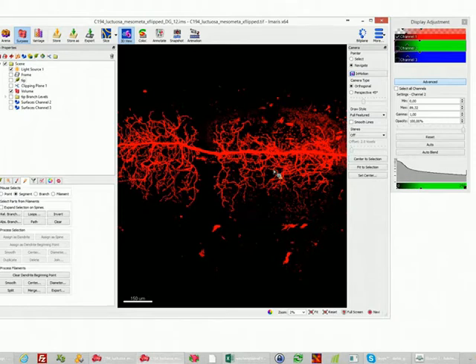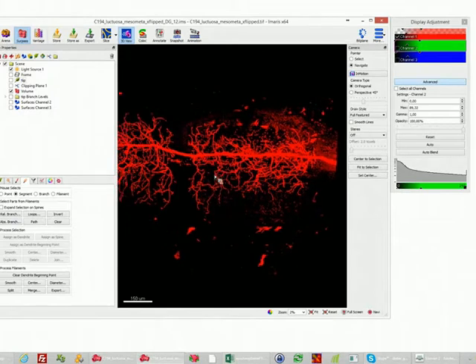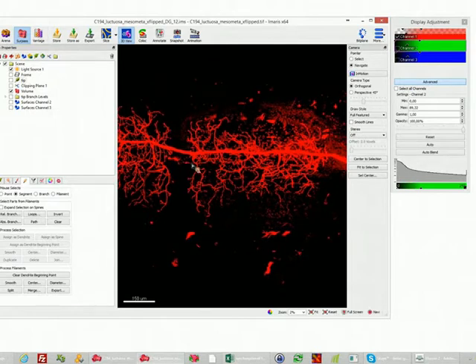So I cannot show you the full preparation because this autopath method which we use here takes a while to calculate, so that would go over time. But I want to show you a little bit from the result.